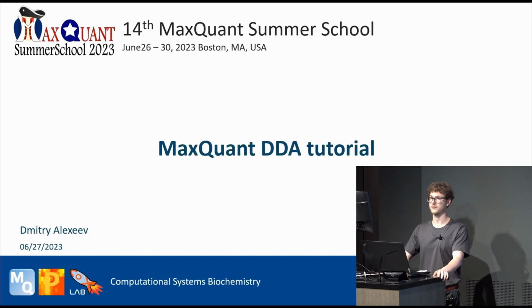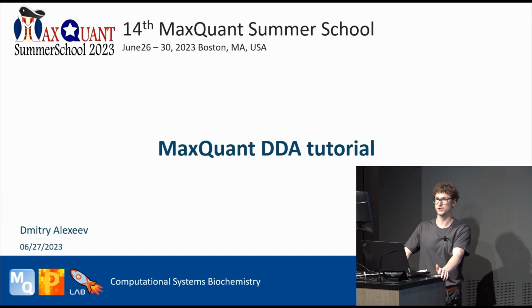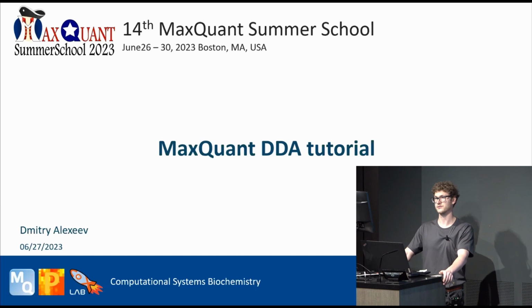Welcome everyone to the first tutorial of this summer school, and it will be about MaxQuant DDA. In the first part, we'll go through different experimental scenarios which you can encounter and proper parameters that you should set up for those experiments. The second part will be devoted to Andromeda configurations, like modifications and proteases configuration, partial processing, and Linux setup.